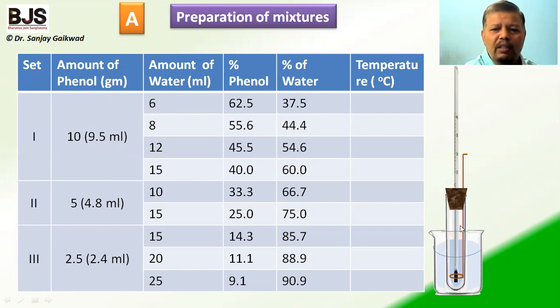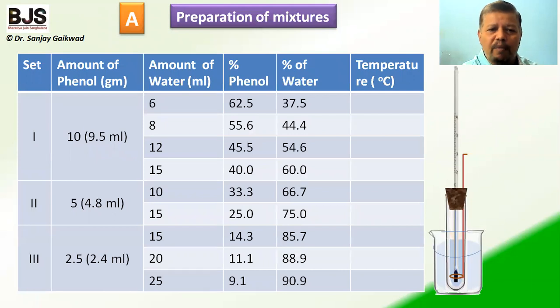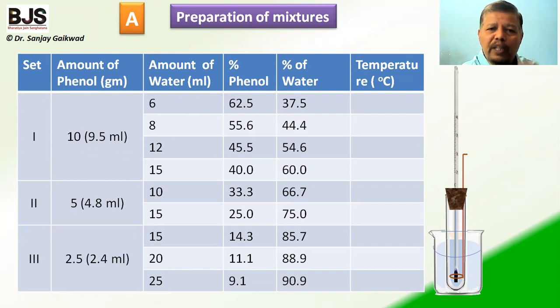These two solvents are added into the hard glass tube. A student asked how to measure phenol. Since phenol is a toxic chemical and is in crystalline form in the bottle, we need to transfer the crystals into molten form. Therefore, we keep the bottle in a water bath to warm it up. After warming, the phenol crystals melt, and that molten phenol can be measured — 9.5 ml — using a measuring cylinder. Care should be taken that phenol must not touch your skin, as it is harmful.